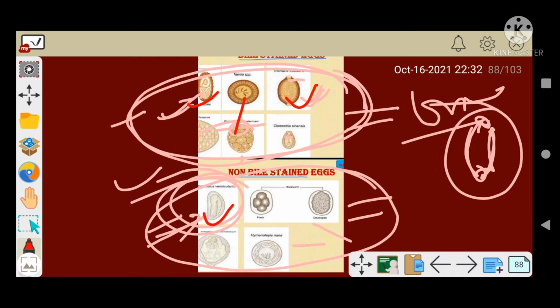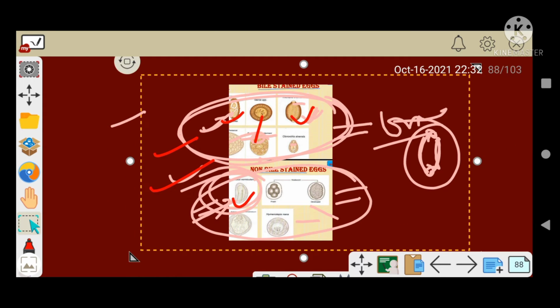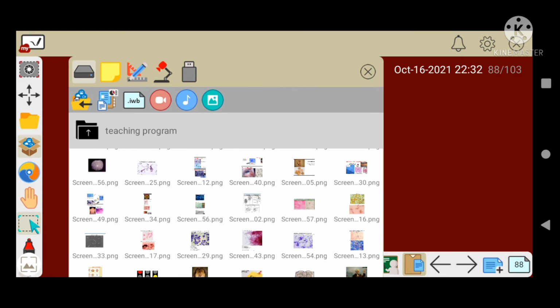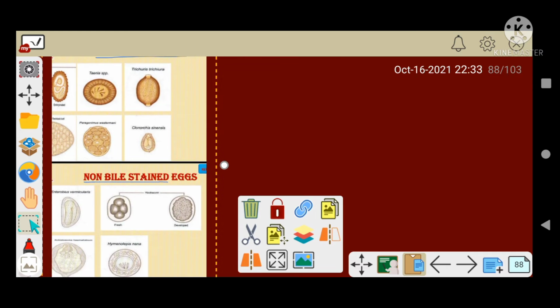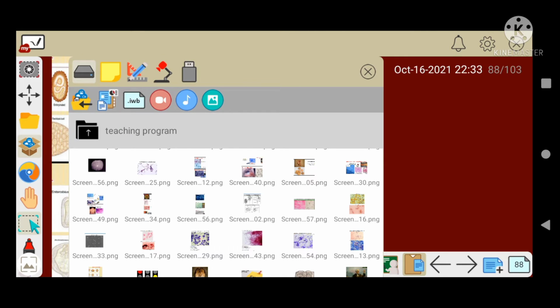This is your scolex of Taenia. So anyway, just remember these two slides. I am showing you again. So this one, please see it before you go for any exam. From here one egg will come, definitely, no doubt about that.